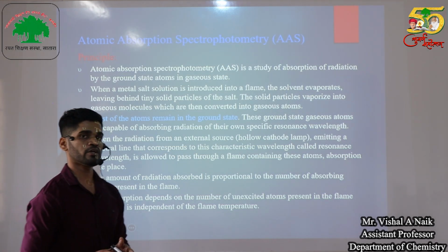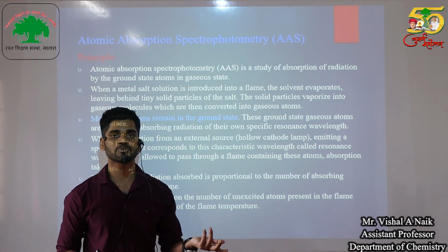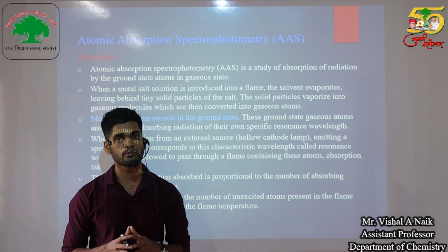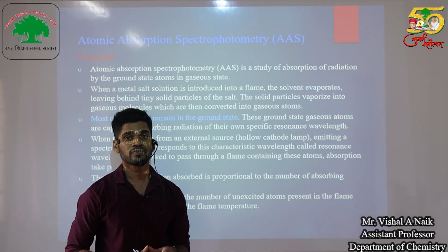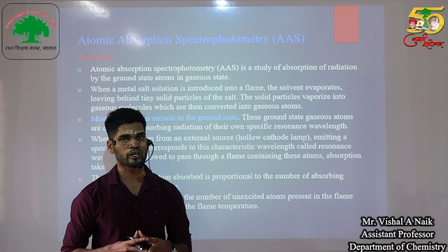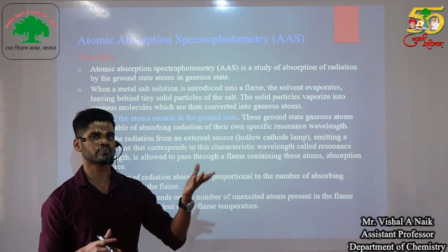In this particular video we are going to discuss the principle of atomic absorption spectrometer, then the instrumentation of atomic absorption spectrometer, then the applications of atomic absorption spectrometer, and last, the limitations of atomic absorption spectrometer. So what is the principle behind this atomic absorption spectrometer?